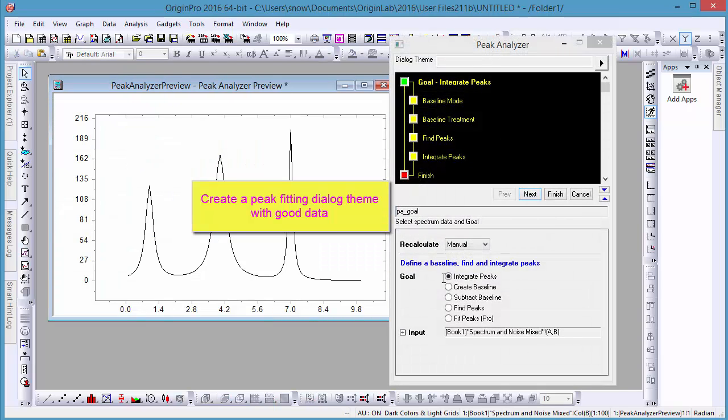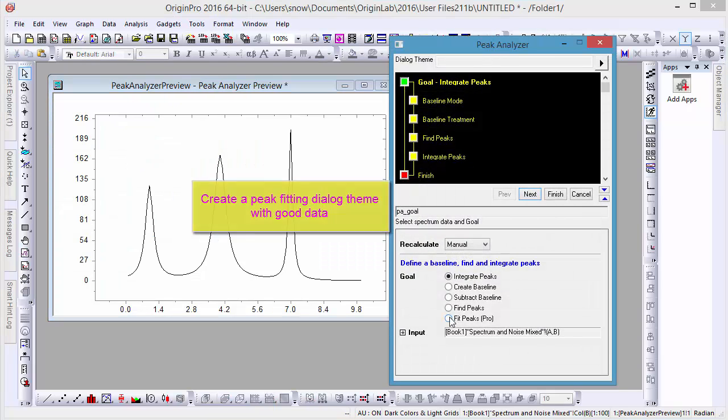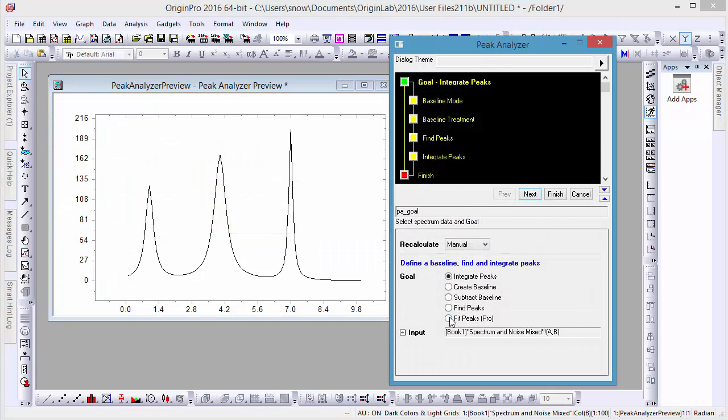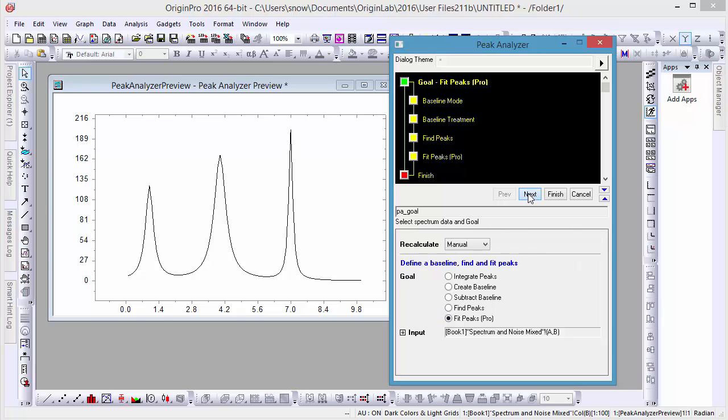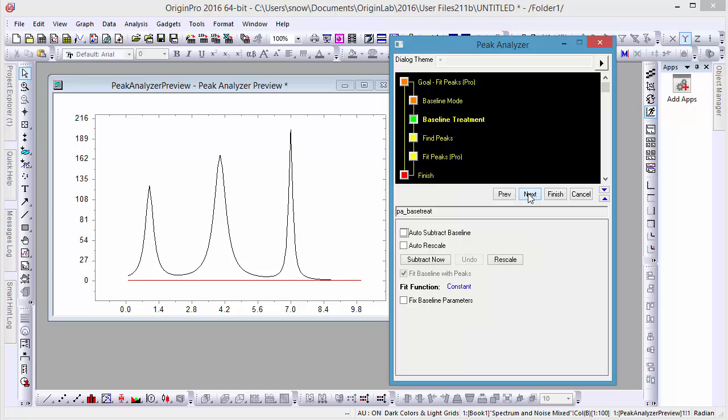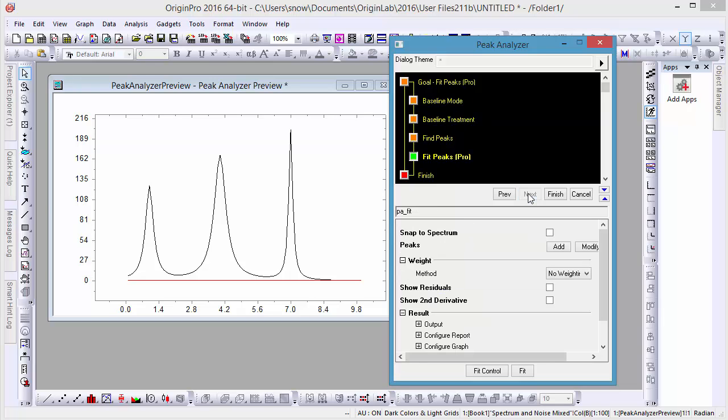In the Peak Analyzer window, you'll see a basic goal flowchart. Rather than our default of integrating peaks, let's change the goal to Fit Peaks. Press Next until we get to the Fit Peaks subwindow, and press Fit.